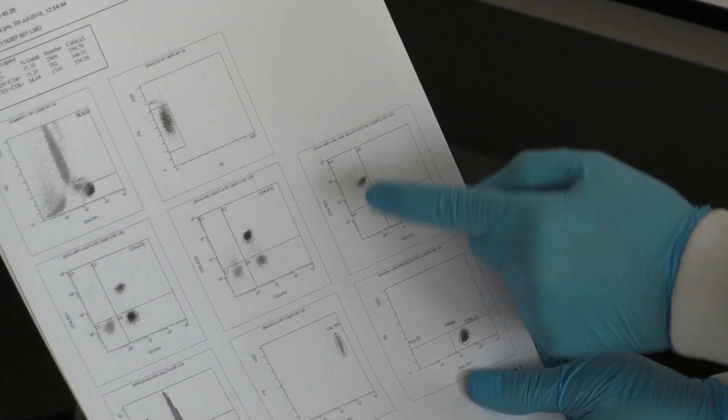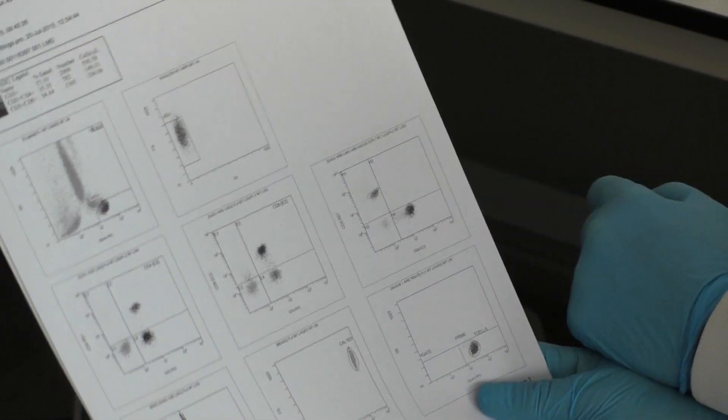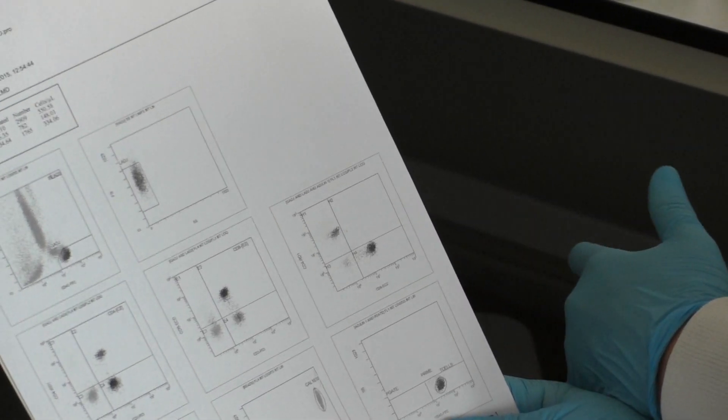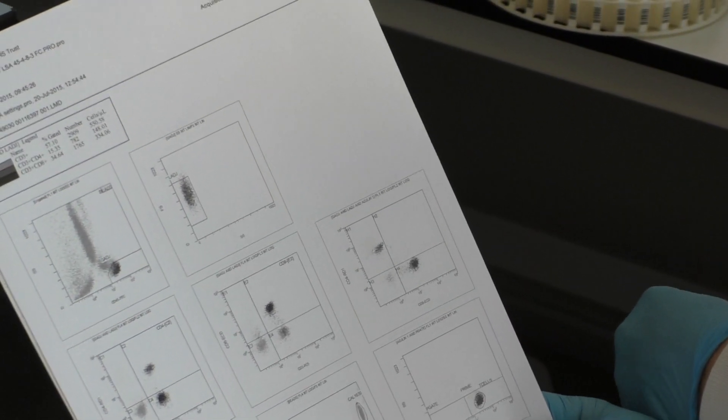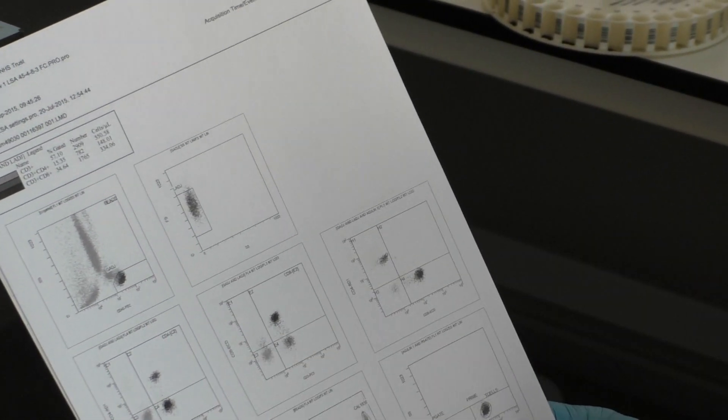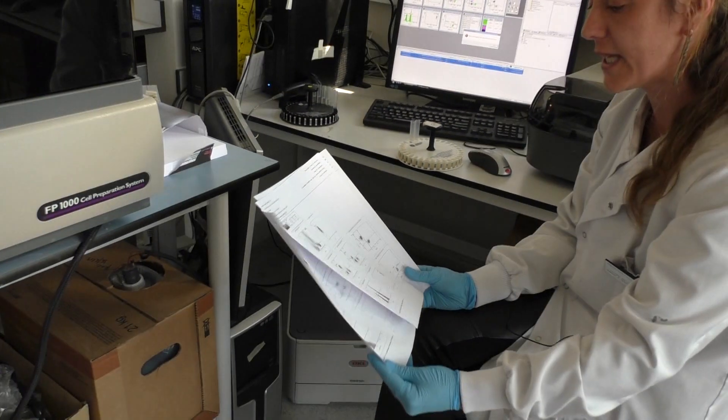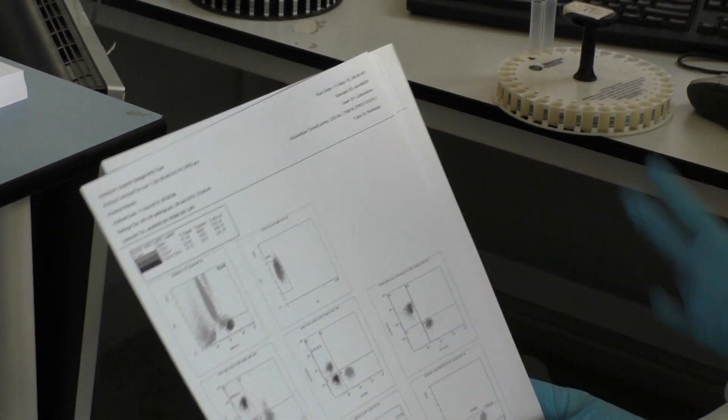We go on to the second page which will do the same thing for the B lymphocytes and the natural killer cells.